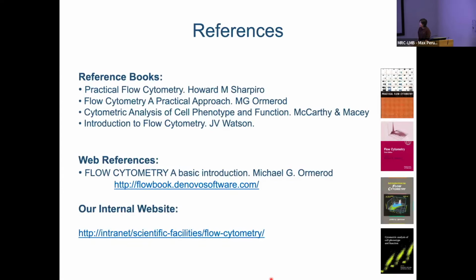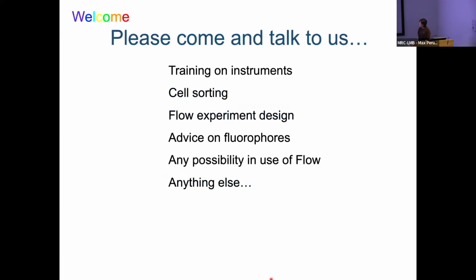Finally, there are some references for flow cytometry if you are interested. I'm sure you'll find lots of resources online. There are some of them if you're interested to look at, or you can come and talk to us. We can train you on our flow cytometers, especially analyzers. When we train you, we'll talk you through the basic concept of what a flow cytometer is and what you're actually looking at. If you need help, please contact us.